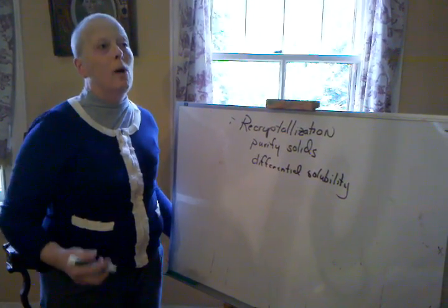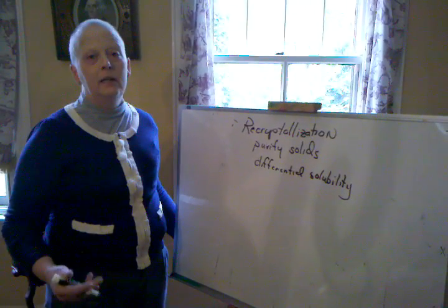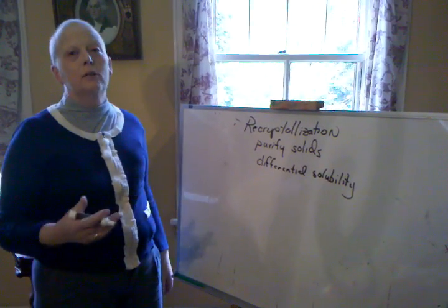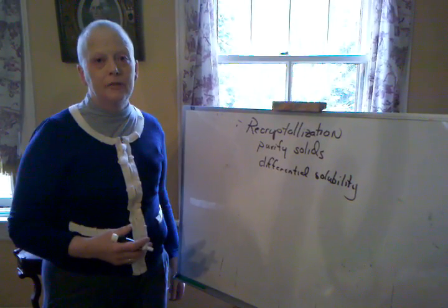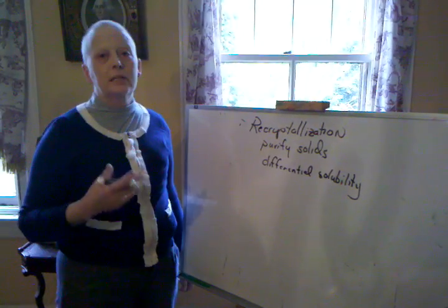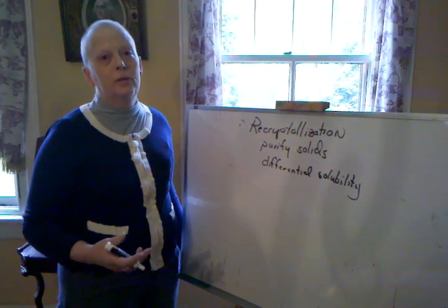Now you might wonder, why is the product of a reaction that's a solid contaminated? Well, when you do a reaction, very often you get side products, and sometimes the reaction doesn't go to completion, so the product will be cross-contaminated with starting materials. And in this case, maleic anhydride is solid, and some of the other products that can form from the reaction are also solids. So if the product is contaminated and it's a solid, probably the first thing you think of is to recrystallize it.